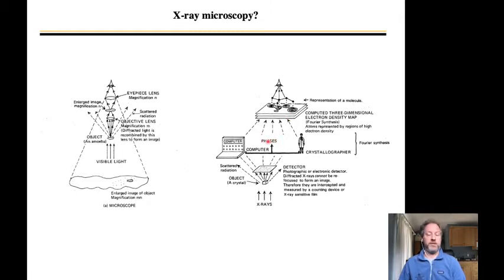The phases, I will talk about this later, but the second most difficult thing about crystallography, the first being growing crystals, the second is the phase problem. Solving the phase problem is important and difficult, but modern computers can do it pretty easily for a general data set. So I'll talk about the phase problem when it comes up later, but I'm bringing it up here. That's a very important input into this step of assembling the image.